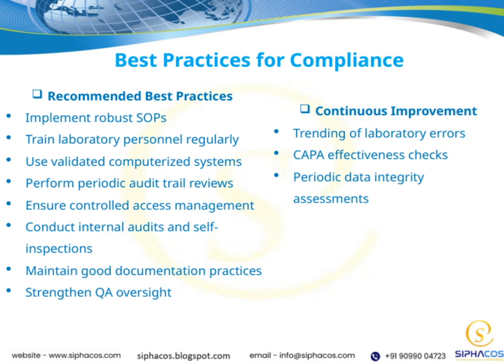Moving on to best practices for compliance, implementing robust standard operating procedures, SOPs, is fundamental. Clear, well-documented SOPs guide our team and ensure consistency in every task. Training is equally important. Regularly educating our laboratory personnel keeps everyone up to date with the latest procedures and standards. Using validated computerized systems enhances accuracy and reduces manual errors. But remember, these systems must be properly validated before use.